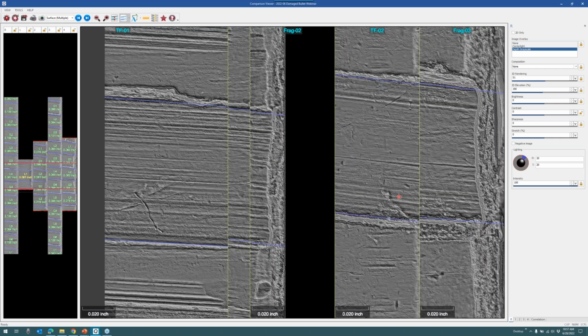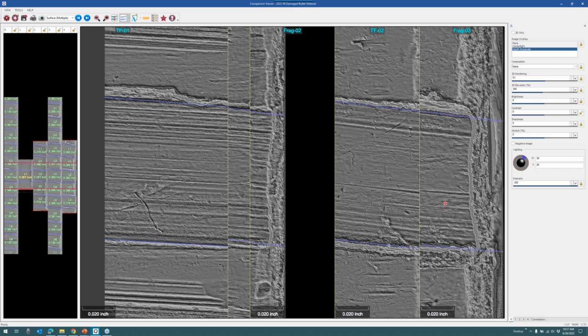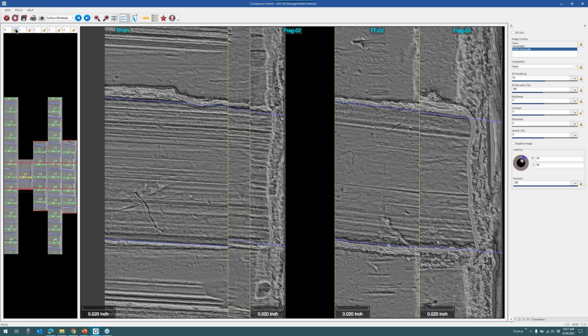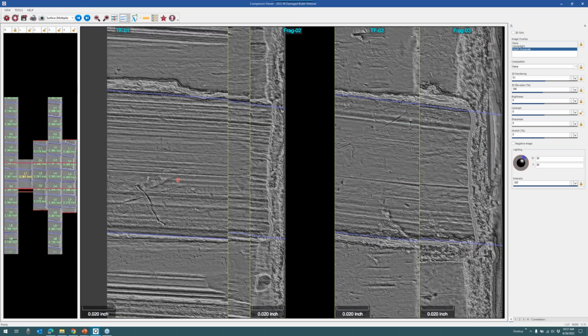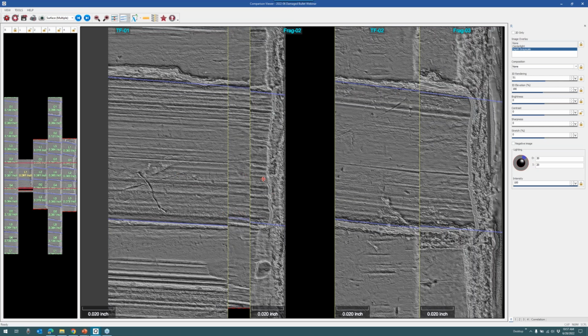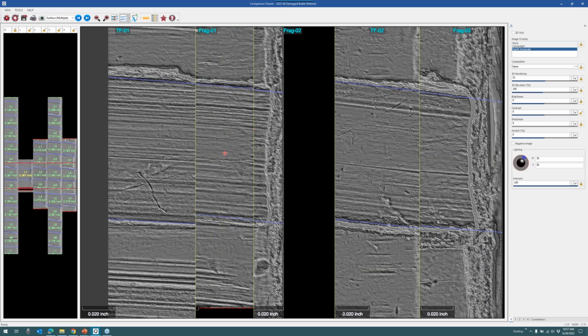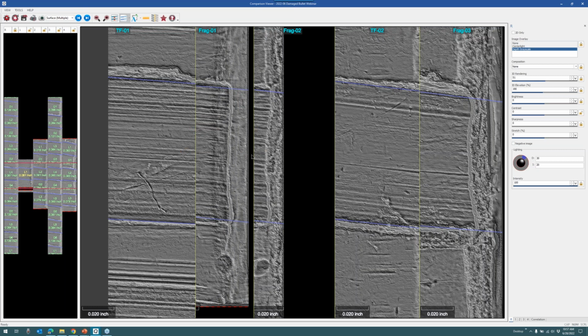Here we go. So I can, let's bring this down to about the same height as the other ones. And then if I lock this again, I can bring all of them up to about the middle of the screen here. I can set up an ongoing match between my first set of comparisons. Let's move this so that I can see the title of fragment 1 in it.